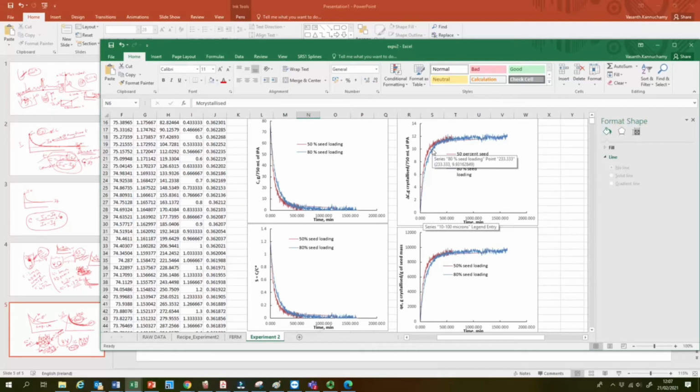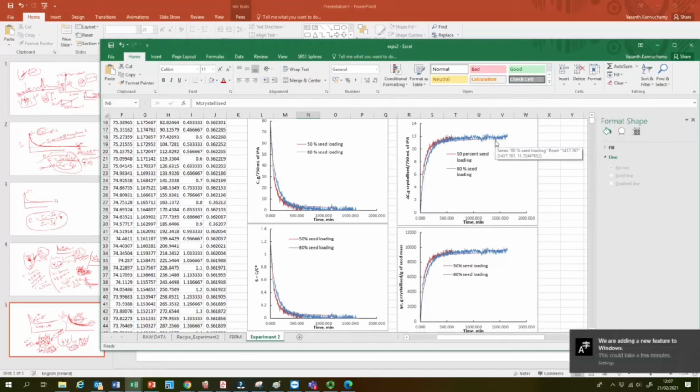In the first, what's the time here, 2:33. If you see the mass crystallized from time t equal to 0 to roughly around 200 minutes, it's very fast in the first roughly 3 hours, and then the growth kinetics is very slow. Yeah. So try to mention this in your report. That's really important. Yeah? So these are some observations.